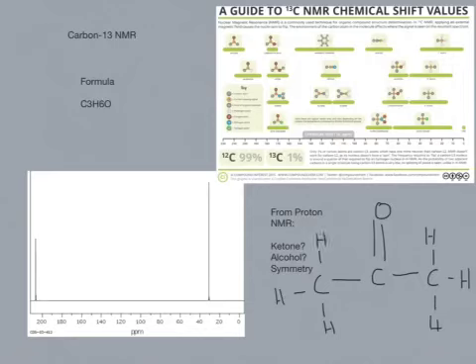It's worth noting that carbons do not split in Carbon-13 NMR like hydrogens do. In this molecule, so far, it seems to be that that remains true. As well as our hydrogens, they will split, but in our molecule, the symmetry allowed them to both be considered one group, since they are symmetric.